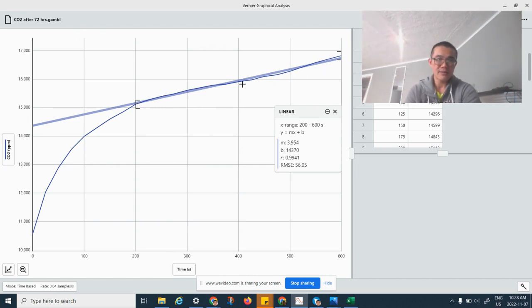Even, and as you see here, it's not perfect. You see some curve here and some valleys here. It's not perfect, but this looks good enough. So to select this option, I just click and select. Now I already have a linear graph.